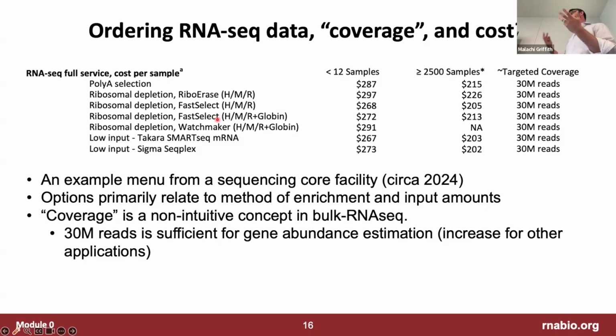So they made this argument that if you're doing differential gene expression analysis, which is a very common one, what many of us are doing, and that's why we use it as the bioinformatics demo here, you'll get more bang for your buck sequencing more samples than doing a fewer number of samples but sequencing them more deeply. And that's all true. And that's where this 25, 30 million amount came from. They did an analysis of different amounts of data, and they determined that for most RNA sequencing experiments, by the time you've sequenced 25 million reads, you can get a pretty good readout of gene abundance. Yes.